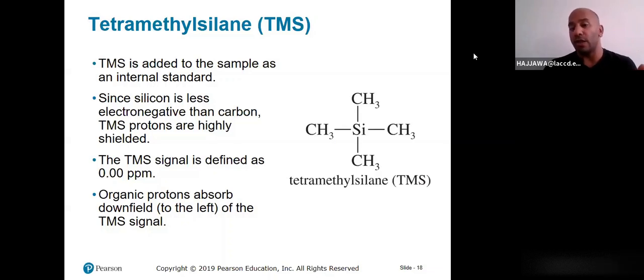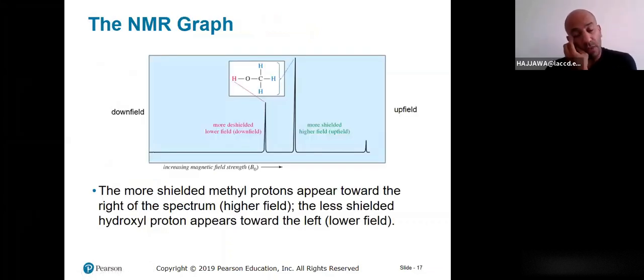We know already that the hydrogens on those methyl groups on the tetramethylsilane usually show up at 0 ppm. So if I have a sample and I run a proton NMR spectrum, and I see the TMS peak is at minus 0.5, what is that supposed to mean? That means all my peaks need to be corrected by plus 0.5. That's what it means.